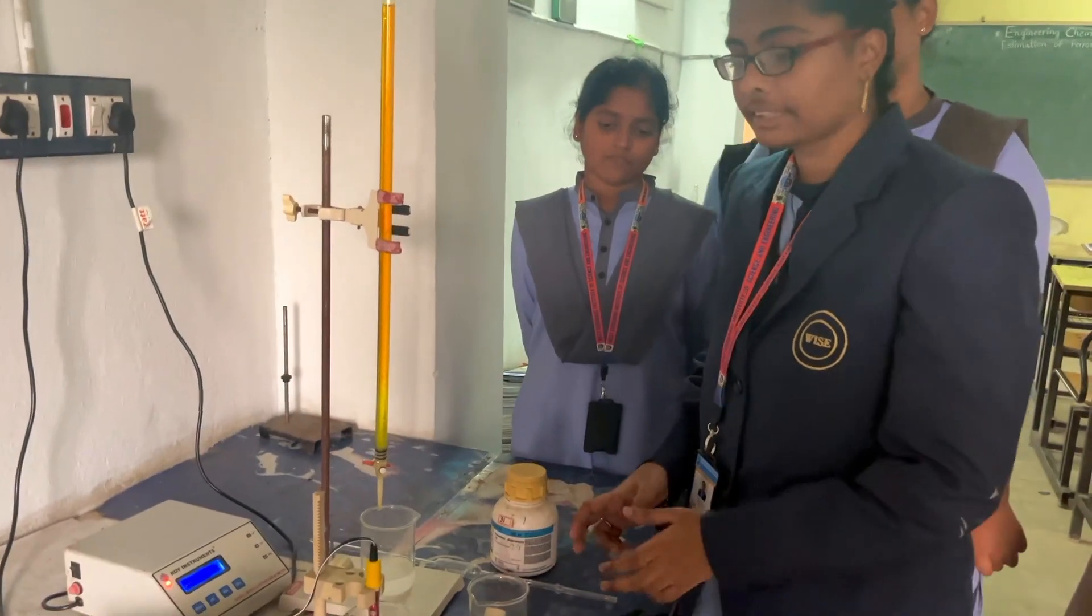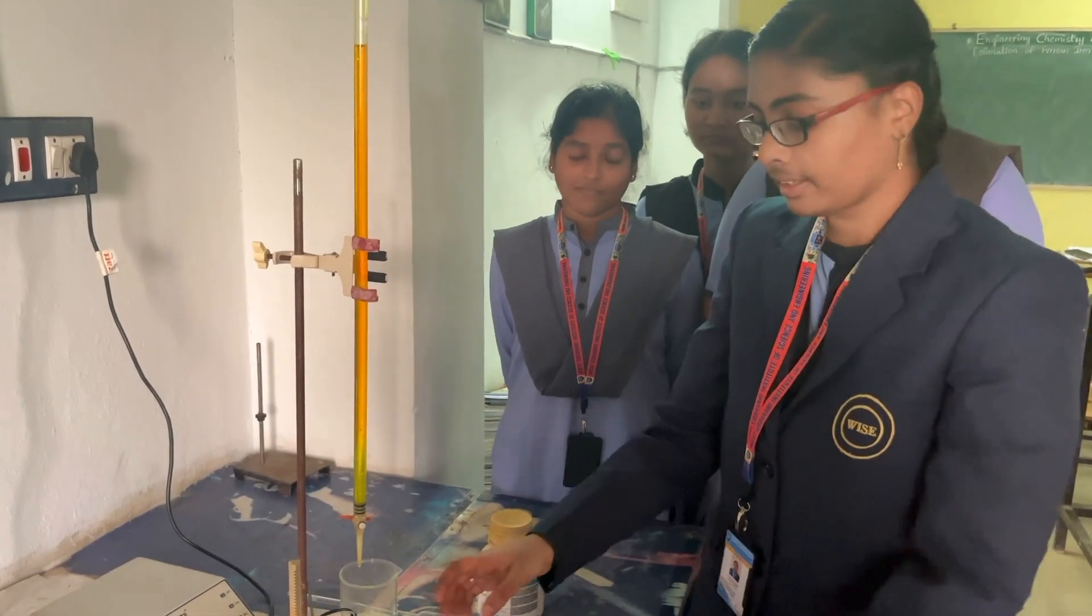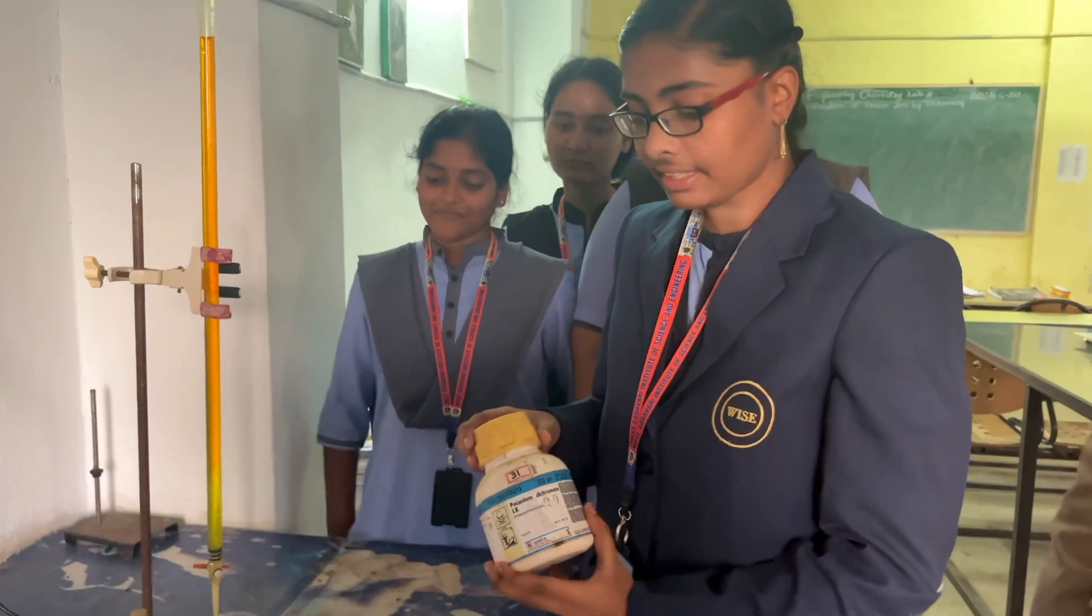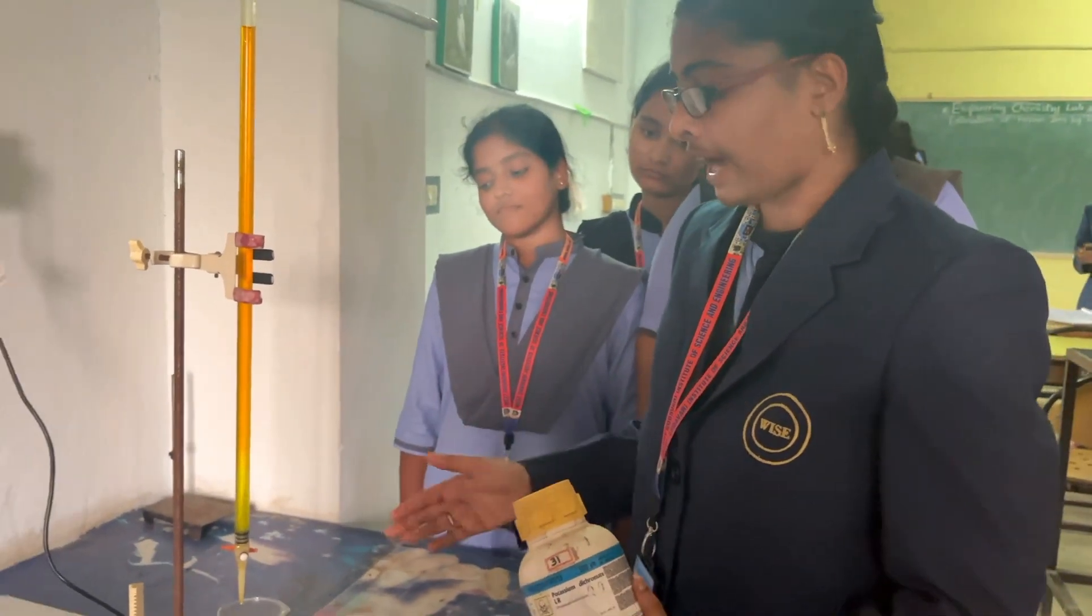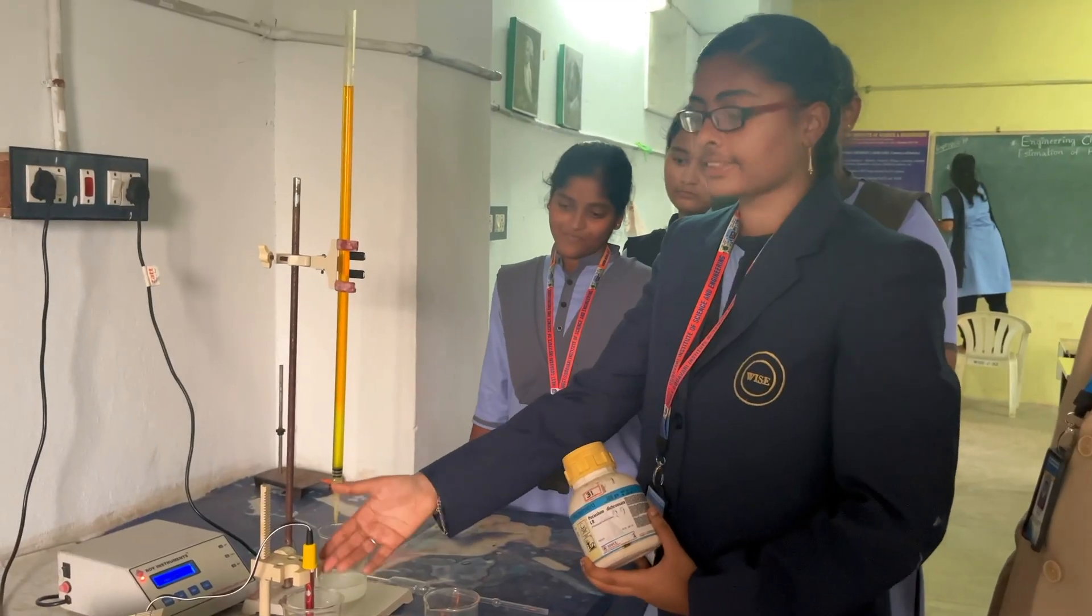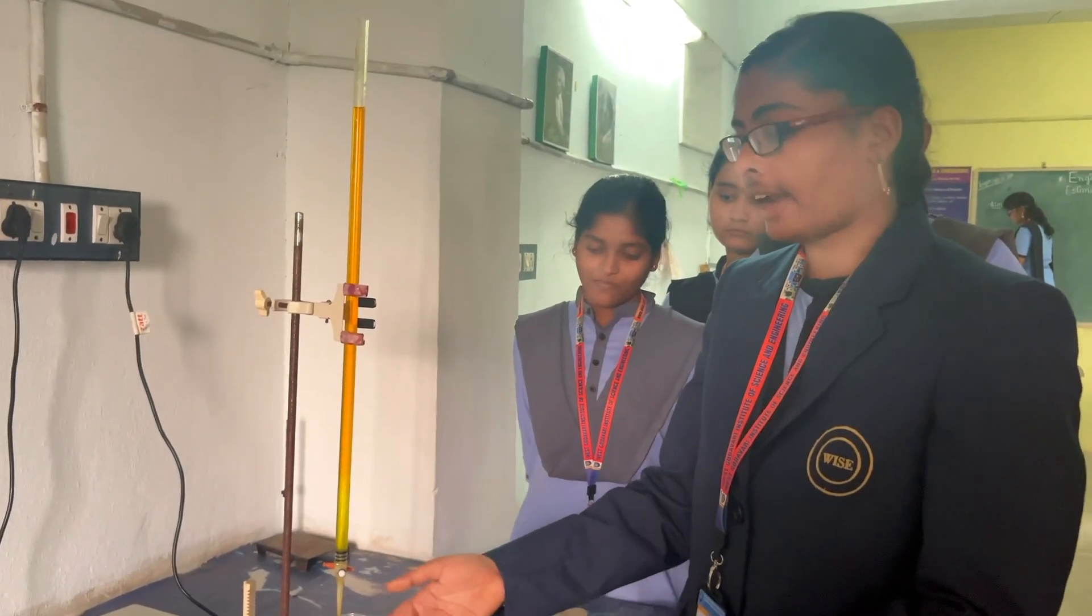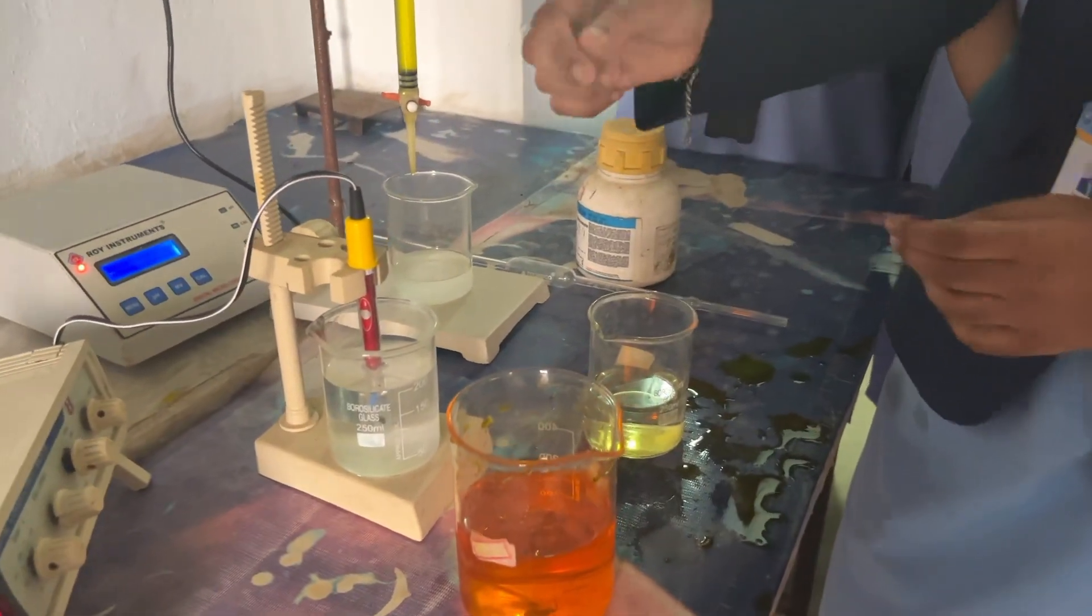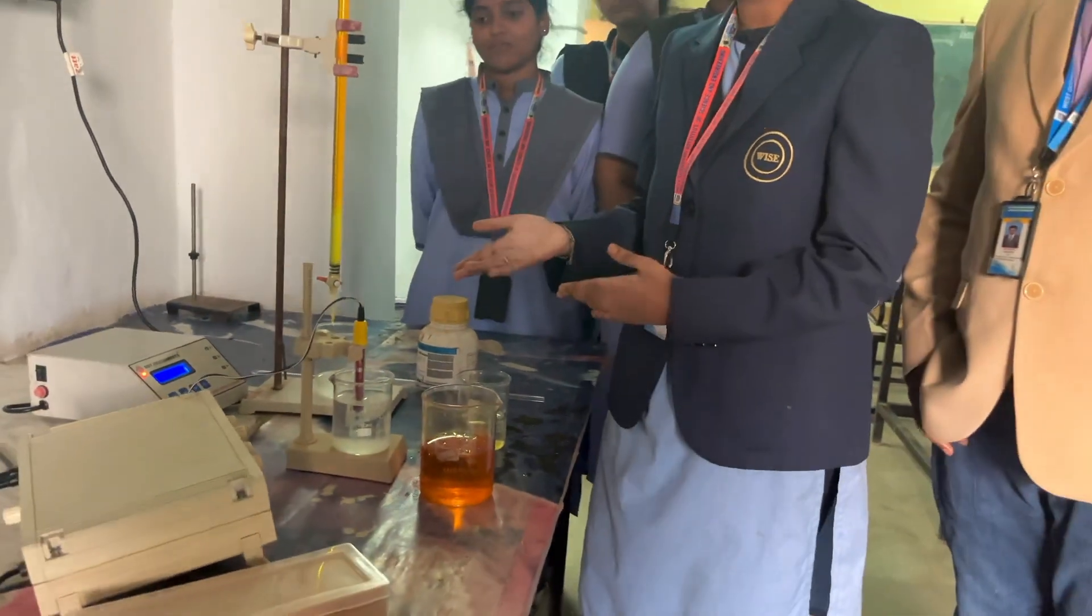Now we have to take the ammonium iron sulfate and add it into the burette, and we have to add potassium dichromate into the beaker. We have to calculate the readings, record them, and draw the graph.